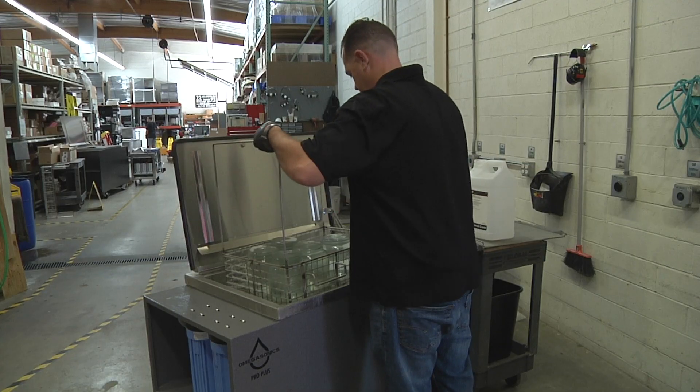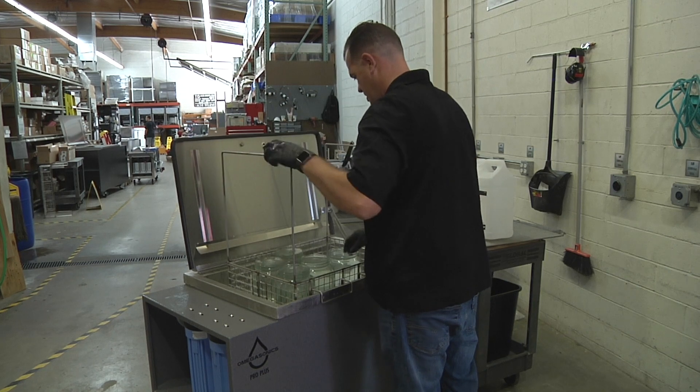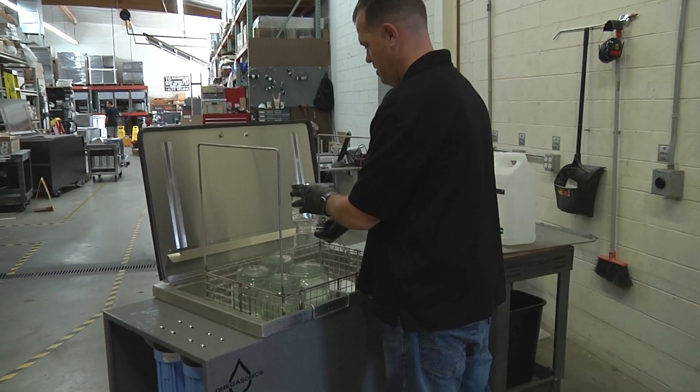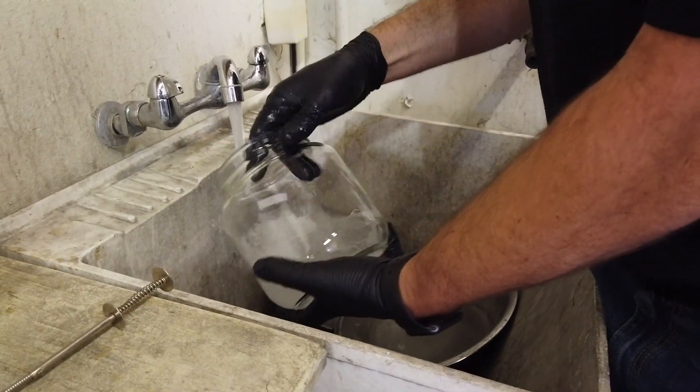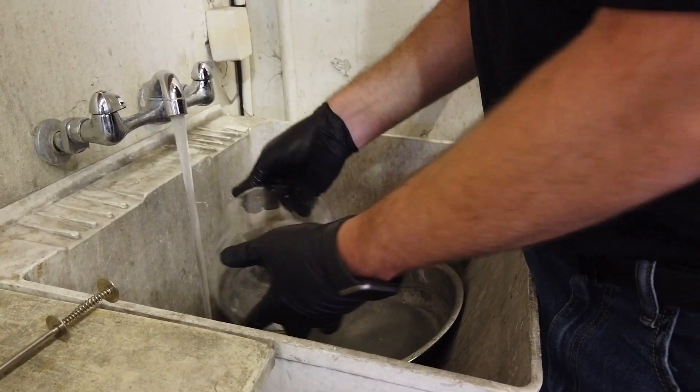Lift the basket out of the tank and hang on the side so that the operator can dump the fluid from each jar back into the bath to preserve the soap water combination. Rinse the jars in clean, warm, free-flowing water.